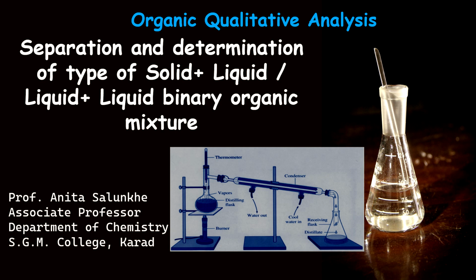Welcome everyone. Let us study separation and determination of type of solid plus liquid or liquid plus liquid binary organic mixture. In the previous video, we saw determination of type and separation of solid plus solid mixture. In this video, we are going to study solid plus liquid or liquid plus liquid binary organic mixture.